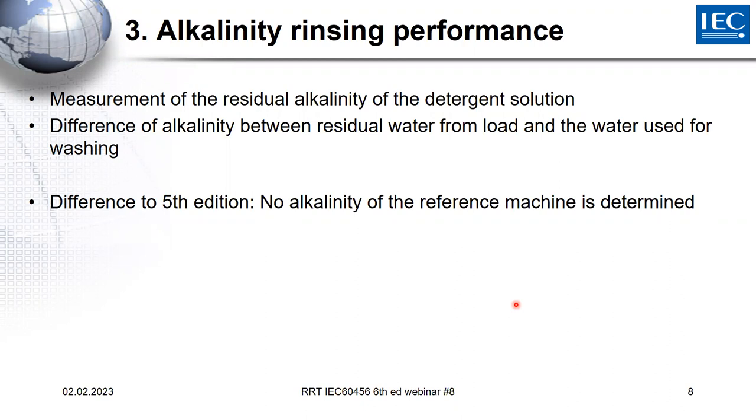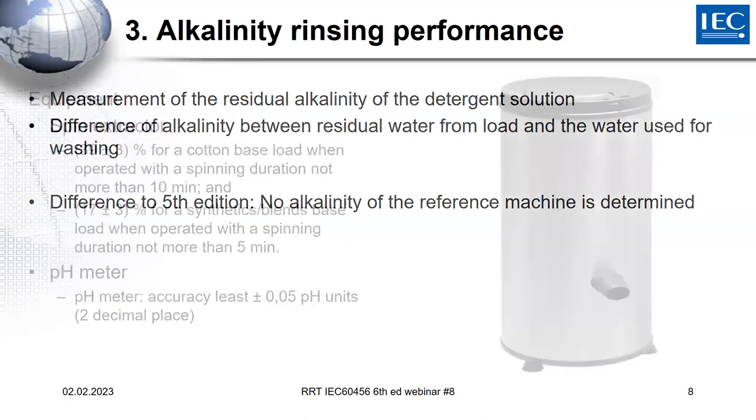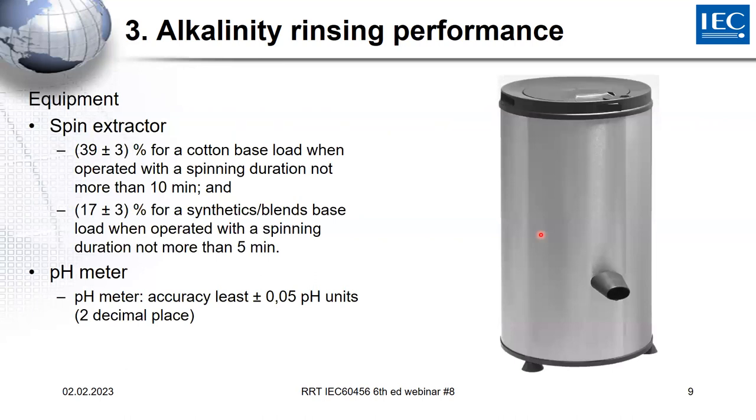This makes it easier for you because you don't have to do additional alkalinity measurement. We found out in comparing data that the measurement of the alkalinity of the reference machine does not improve the repeatability or reproducibility. So that's why it's taken out, because it doesn't give you any positive effect.